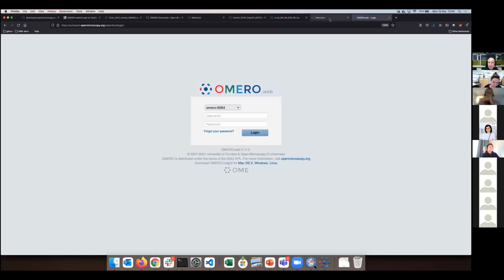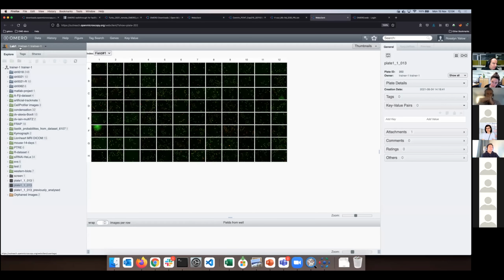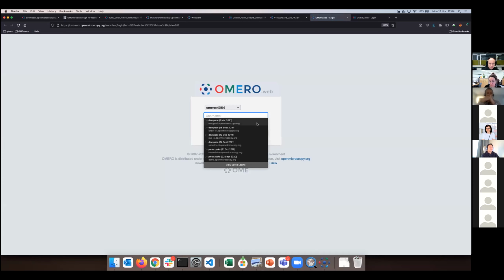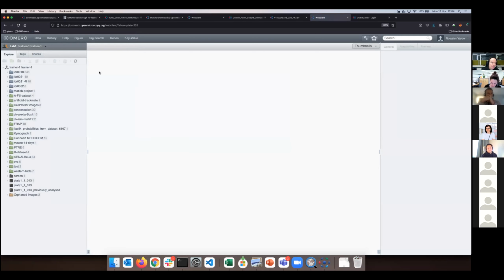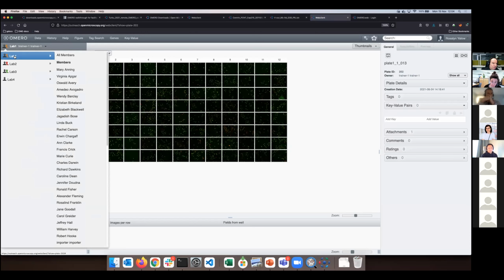Okay, you have to do a little bit of a prep. I'm sorry, I logged out, of course, in one tab, and now it's logging me out everywhere. So you have to create a new group in your server. Let's say call it public group. Okay, it's a read-only group. You create a user in Omero called public user. The public group is a normal standard read-only group, and you move the data into that group.